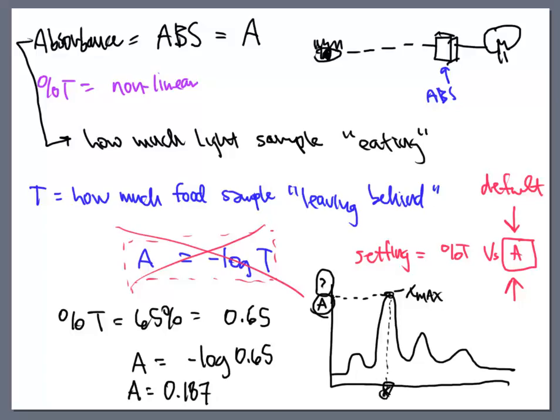So the way that you need to regard this is I'm going down the buffet aisle, and I really like the soup beans that they put on that buffet line. So that is my Lambda Max. So I'm going to get a bowl, and I'm going to fill it full to the rim with soup beans, pinto beans. So that is my absorbance value. It's telling me what the favorite is, and at that favorite, how much is going on. And that is the absorbance value that's popped out of the machine.